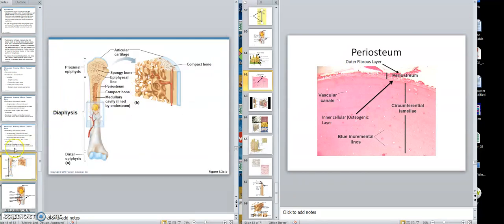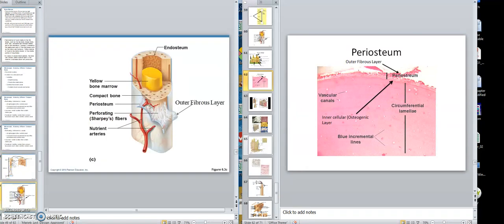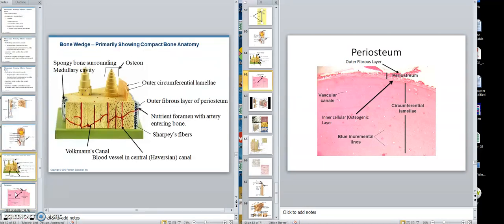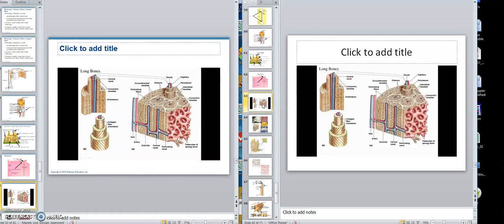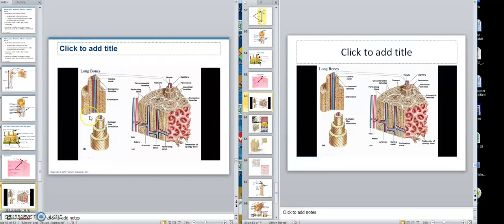Here again is this picture. Now taking this picture here, we see all of these osteons with their concentric lamellae. Right here is one osteon, and remember the angulation is different to give support and strength. Here we're opening this up and we see these blood vessels in there. So that's where we are up to now.